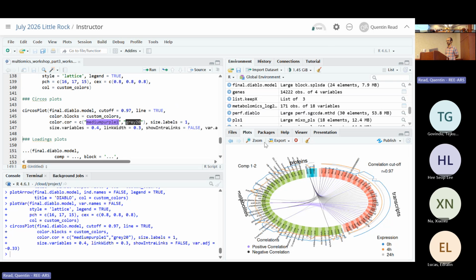So the problem with these plots is that ideally you wouldn't want to see the features that are not correlated, and when you do your cutoff, they don't cut them out. So what you can do is store the plot function into a variable and it will give you a correlation matrix. And then you can plot that yourself, instead of keeping all these ones that don't have any lines coming in or out of them, and that would simplify things down a bit.